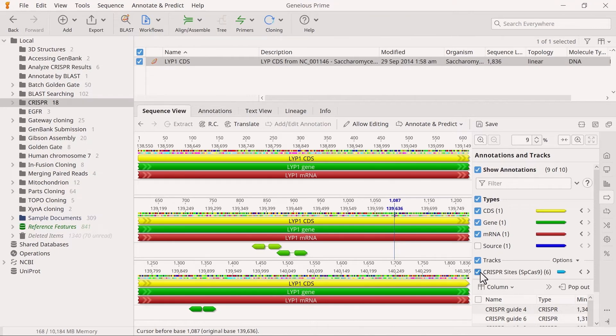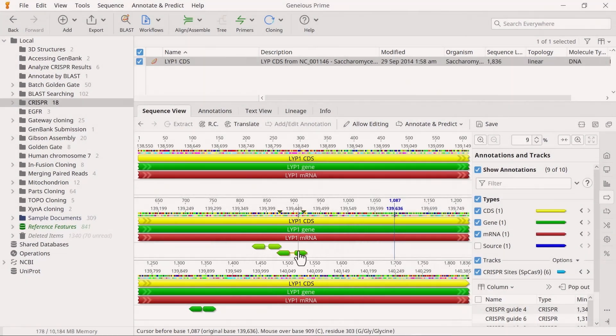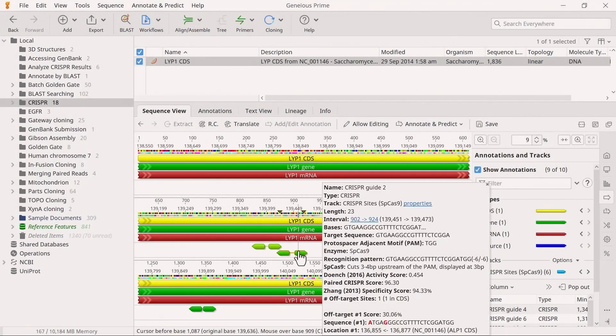Each pair of CRISPR sites has a combined paired CRISPR score, which displays when you mouse over an annotation. This combined score is the mean of the specificity scores of each CRISPR site.